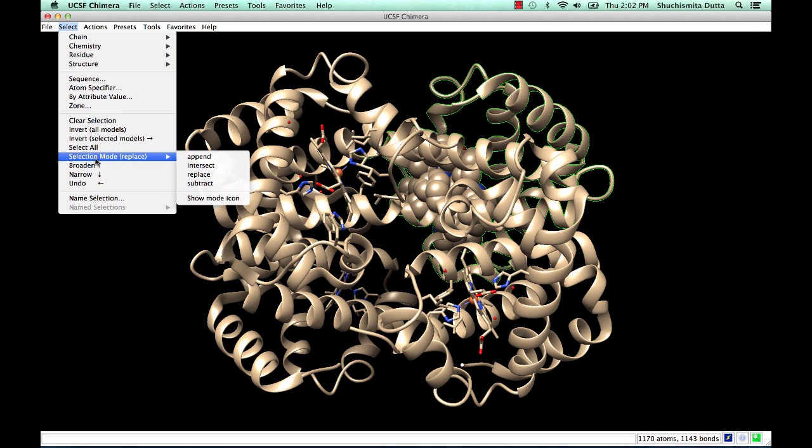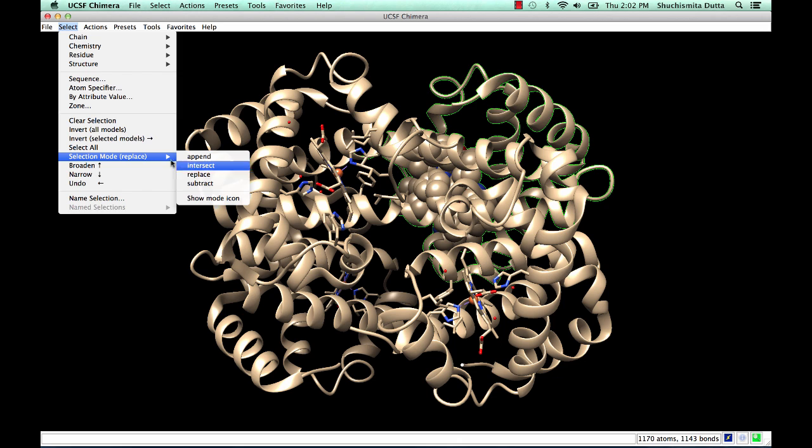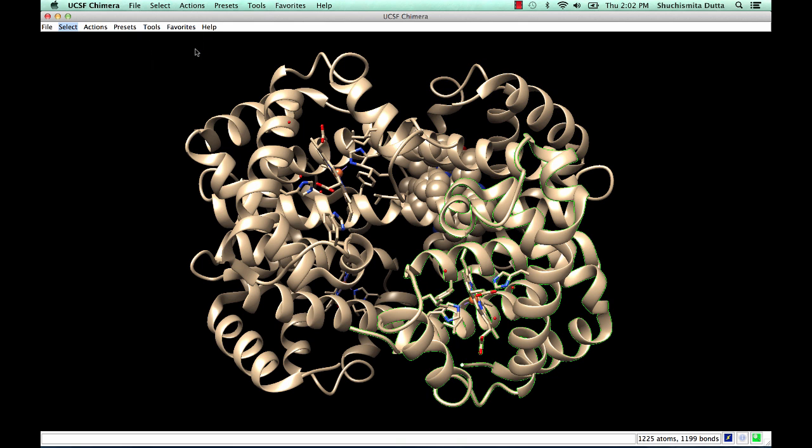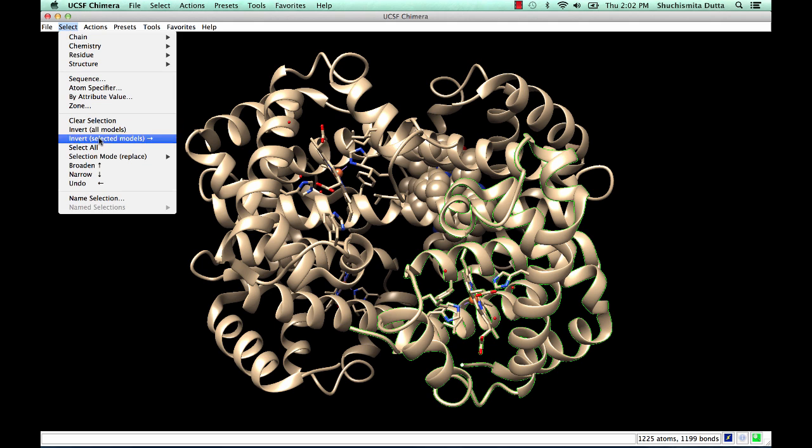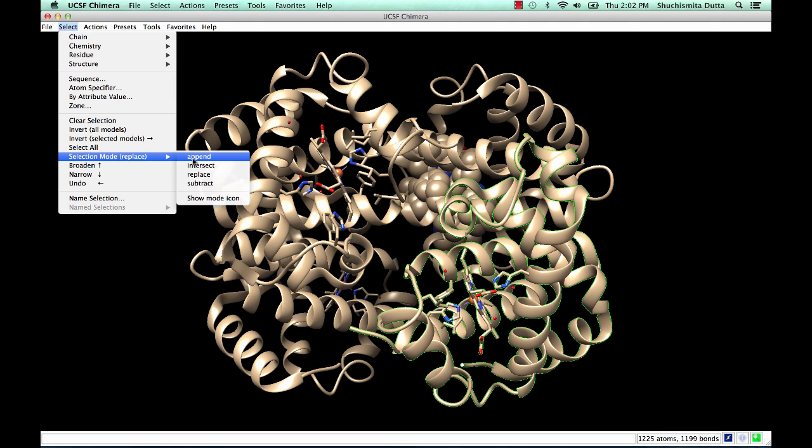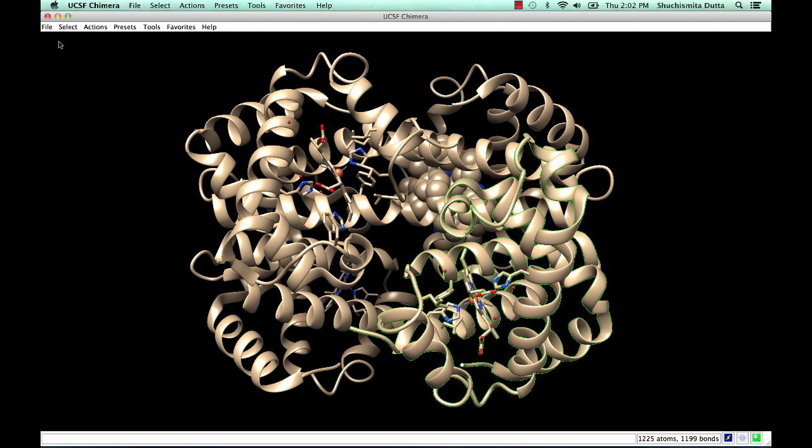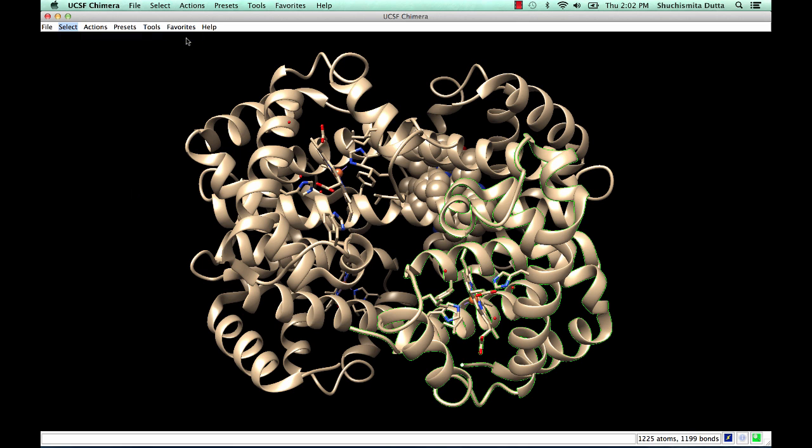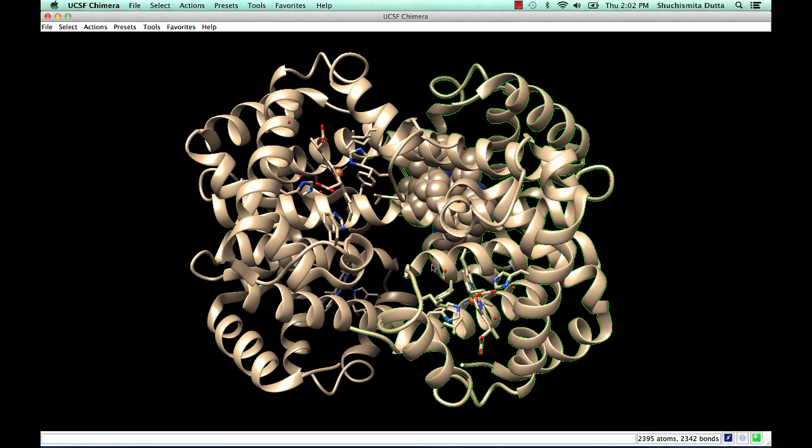Normally, the selection is carried out in the Replace mode, which means that if you select chain B, chain A is dropped and chain B is now the highlighted chain. But you could change the selection mode to Append, and now if you select chain A, both chain B and chain A are highlighted.